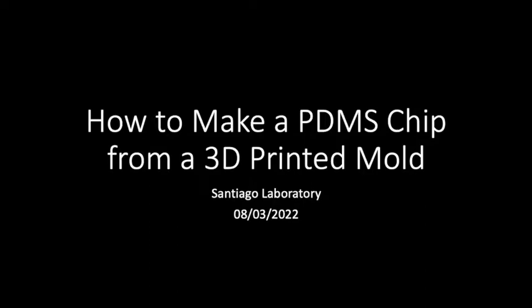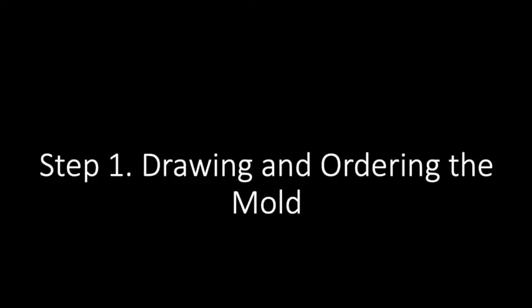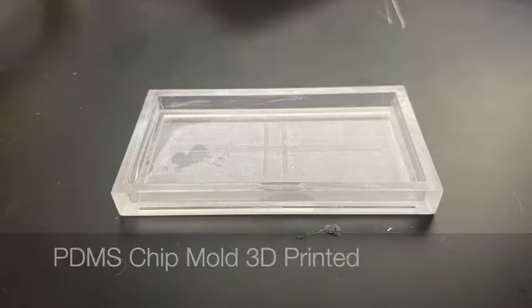In this video, we will describe a method of creating microfluidic chips made of PDMS and glass. Step 1 is drawing and ordering the mold. Once a mold is obtained, you can move on to PDMS chip fabrication.